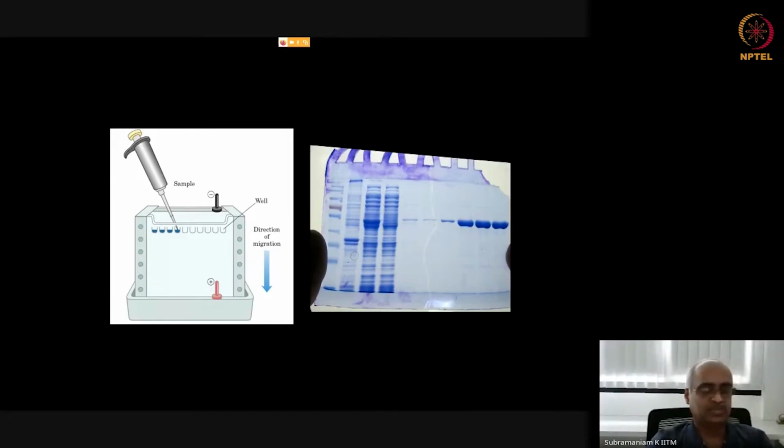What we commonly use for separation, to get a gel like what is shown on the right, is about 1.5 mm spacers. These plastic strips shown here are the spacers. So they are between the two glass sheets. And of course, a spacer is put at the bottom, so whatever you are pouring into the space between the two glass plates does not leak out. And once polymerization is over, the bottom one you will remove.